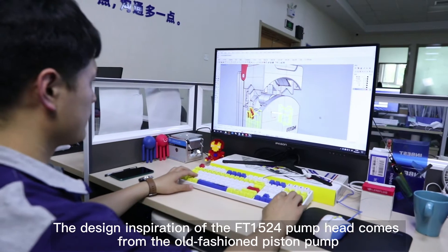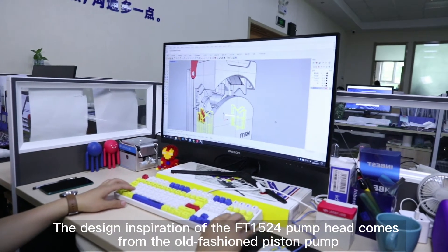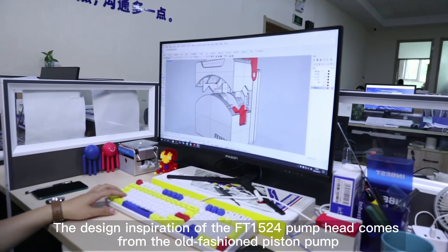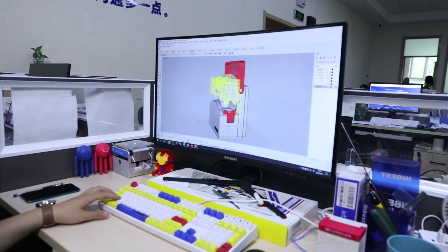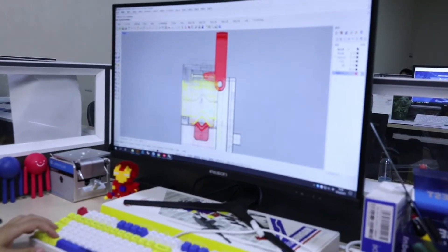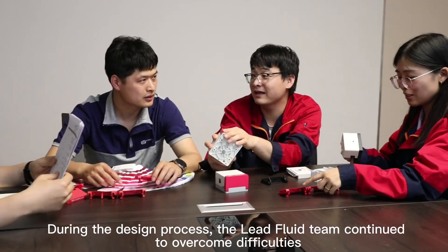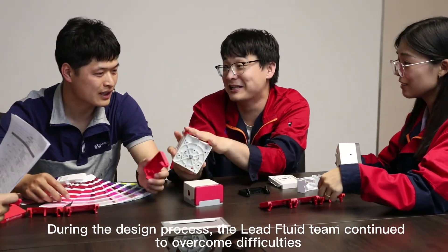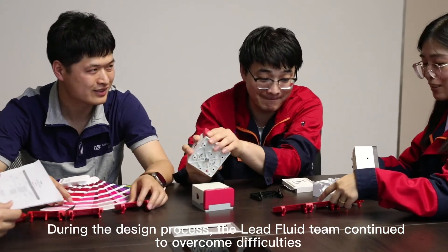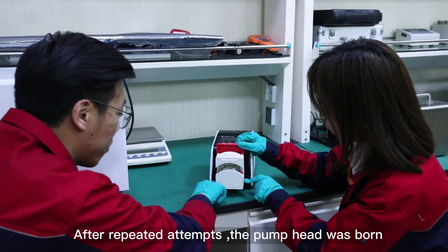The design inspiration of the FT1524 pump head comes from the old-fashioned piston pump. During the design process, the Leedfluid team continued to overcome difficulties. After repeated attempts, the pump head was born.